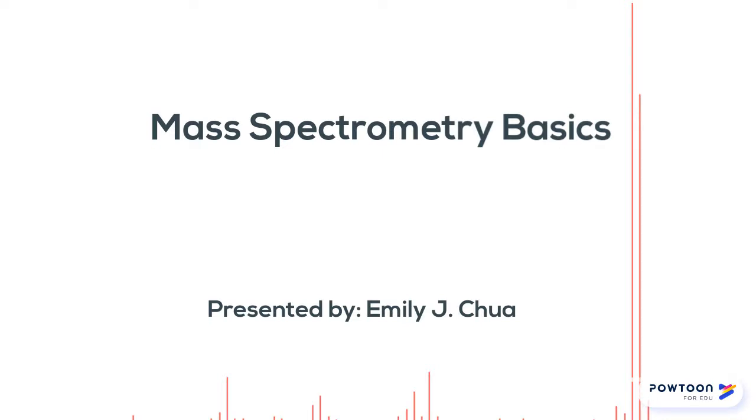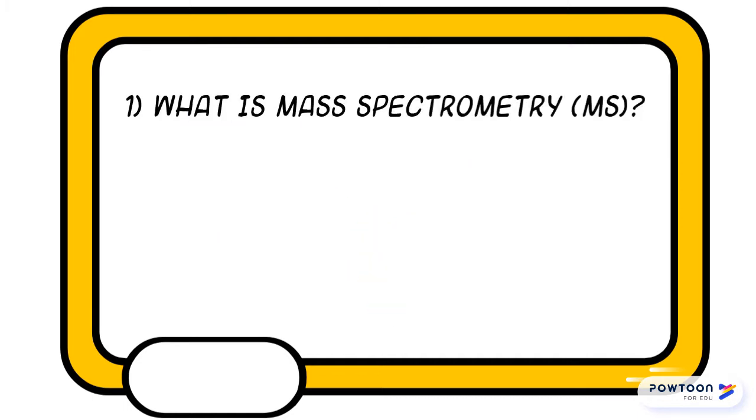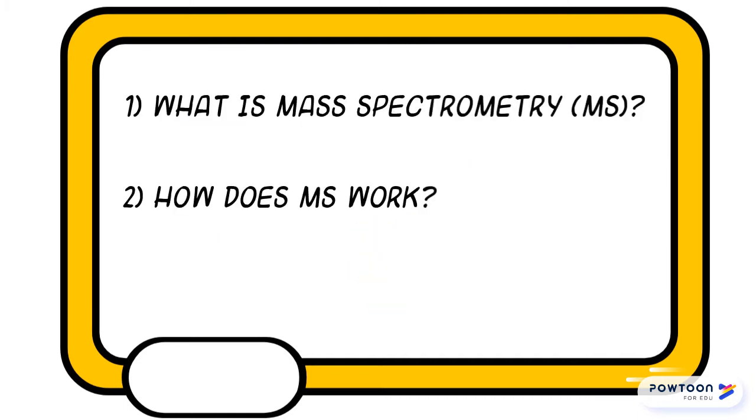When asked by friends and family, who are mostly non-scientists, to explain what my research is about, I find it challenging to give them an answer without causing their eyes to glaze over. Try telling your mom that you are developing a pore water sampling underwater mass spectrometer. So, in order to break down the scientific jargon, in this video I'll be discussing what mass spectrometry is, how it works, and why it is useful.